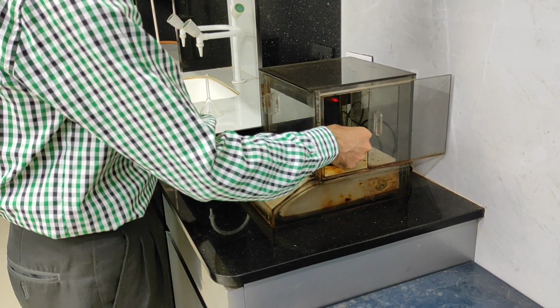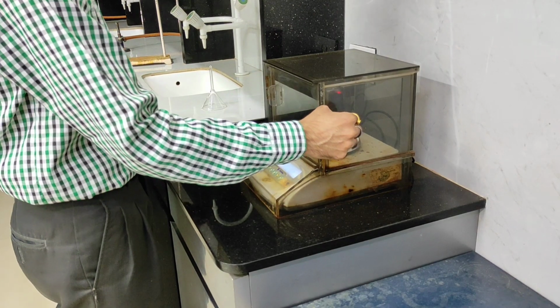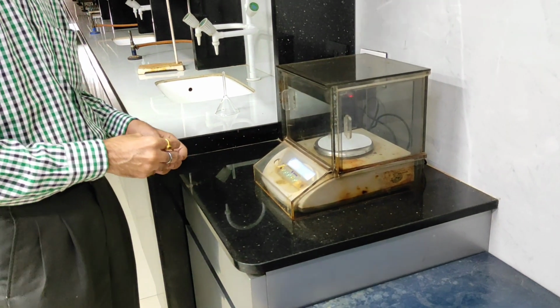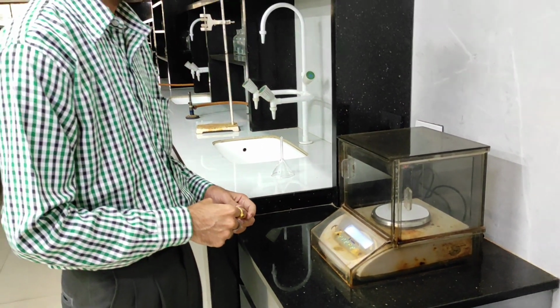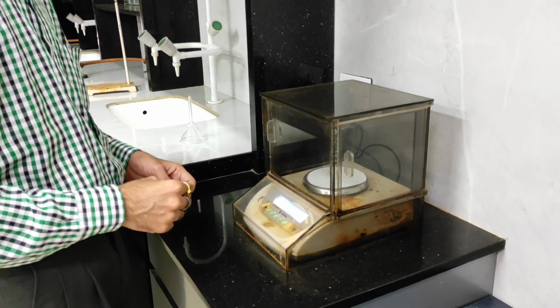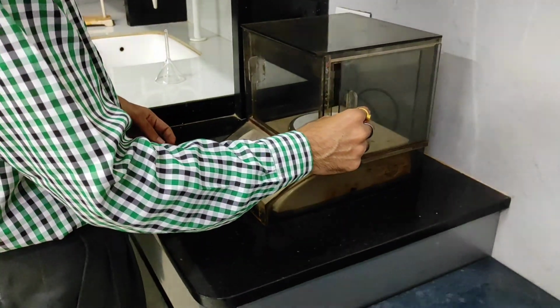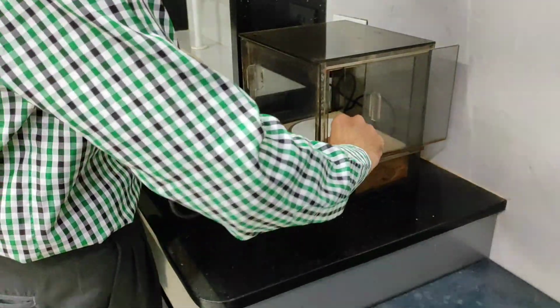We are going to place this Whatman paper. I have cleaned the pan of this balance so that no impurities stick to the filter paper. And you can see the weight is 0.820. Okay, it is 0.820.